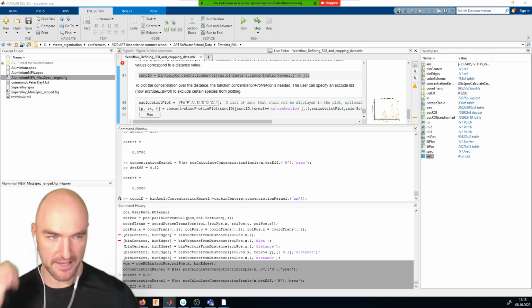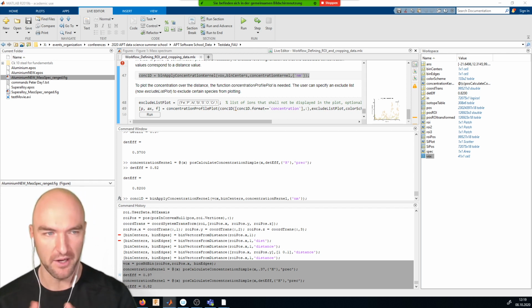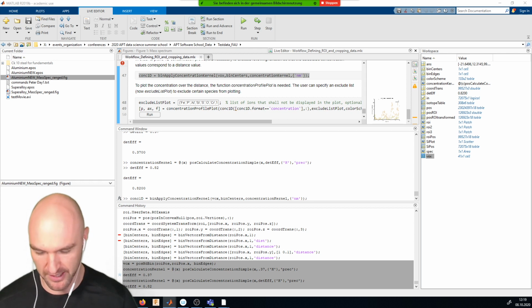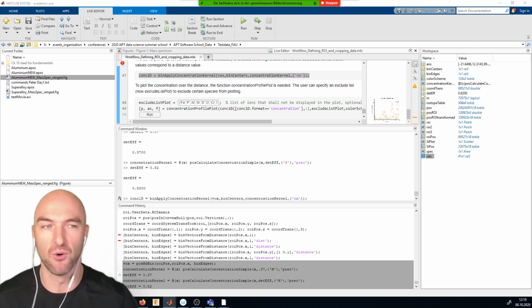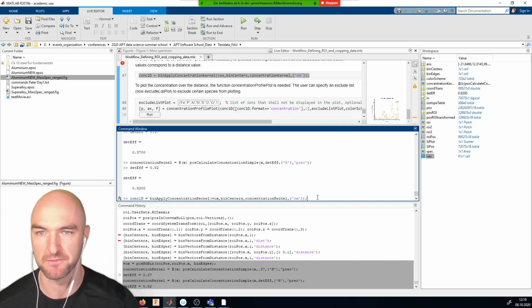Right now, this might all seem like we're taking some detours, but we're not actually taking detours if we want to keep our system as flexible as possible. And you will see it's really helpful that with one and the same function set, you can, for example, create charge state distribution maps, create voxelizations, create concentration profiles, create a profile of the charge state ratio changing, things like that. You can do all of that with the same system with just a few lines of code.